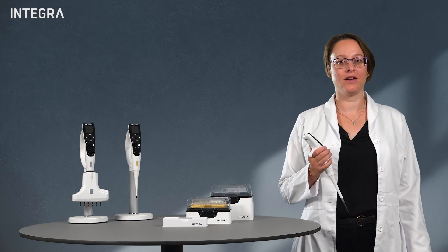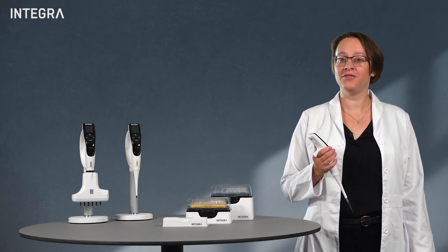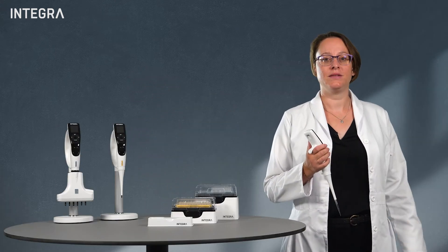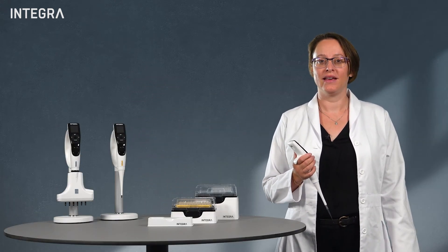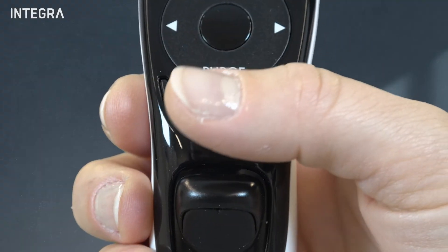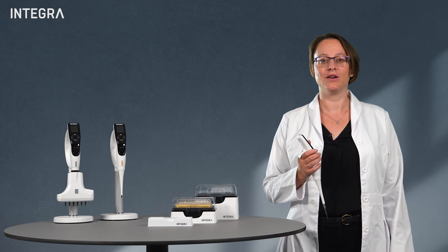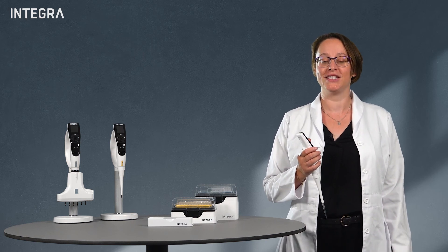One last point to consider is ergonomics. Some of you might feel more comfortable simply pressing a button to aspirate, mix and dispense — this is something which electronic pipets offer. For others, this is not a consideration, so manual pipets do the job just fine.